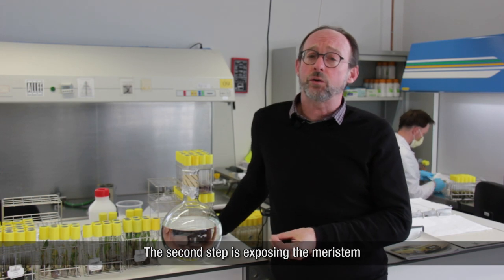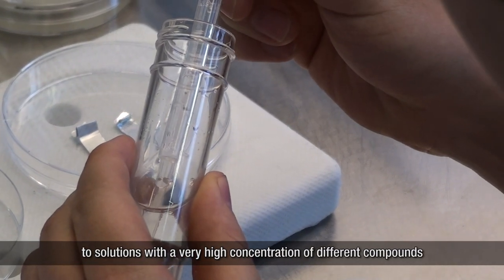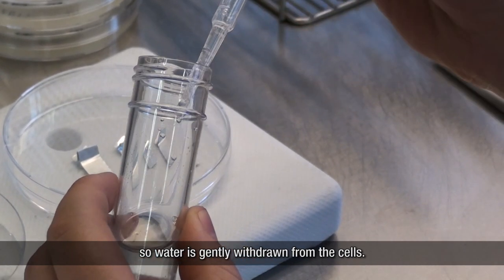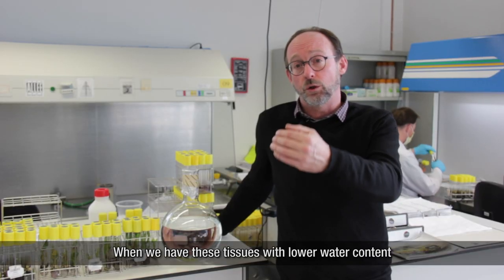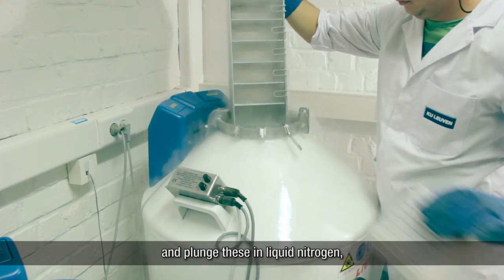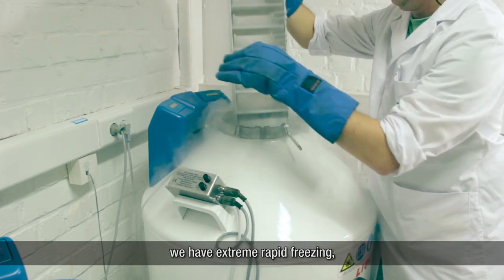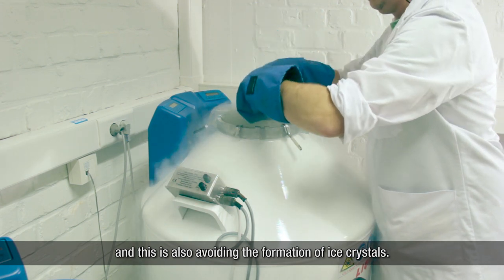The second step is exposing the meristem to solutions with a very high concentration of different compounds, so water is gently withdrawn from the cells. When we have these tissues with lower water content and plunge them in liquid nitrogen, we have extremely rapid freezing, which also avoids the formation of ice crystals. The tissue is then stored in liquid nitrogen undamaged.